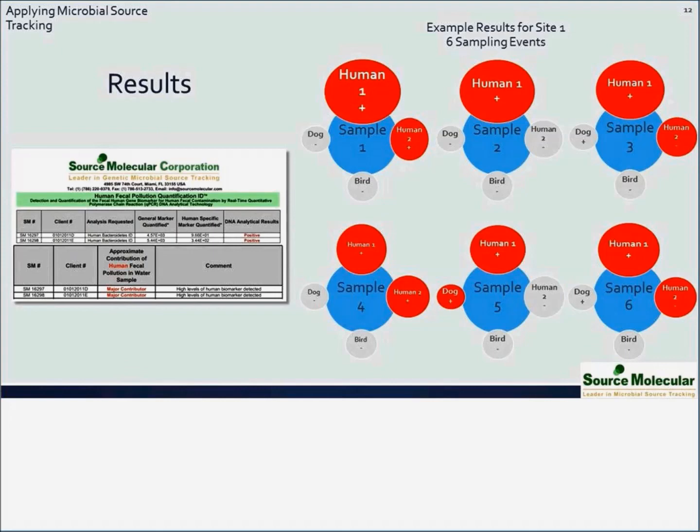I have here another question. Talk about the specificity of the canine test. Does it capture domestic dogs, coyotes, foxes, or raccoons? We've validated, I think once or twice, one of the older, not the EPA marker, but the other dog marker, and it did come up positive in coyotes. How often does that happen? It'd be really hard to say with just 2 data points, but we have seen it. And the EPA marker, it was just published in September, so we have pretty limited data on that one.